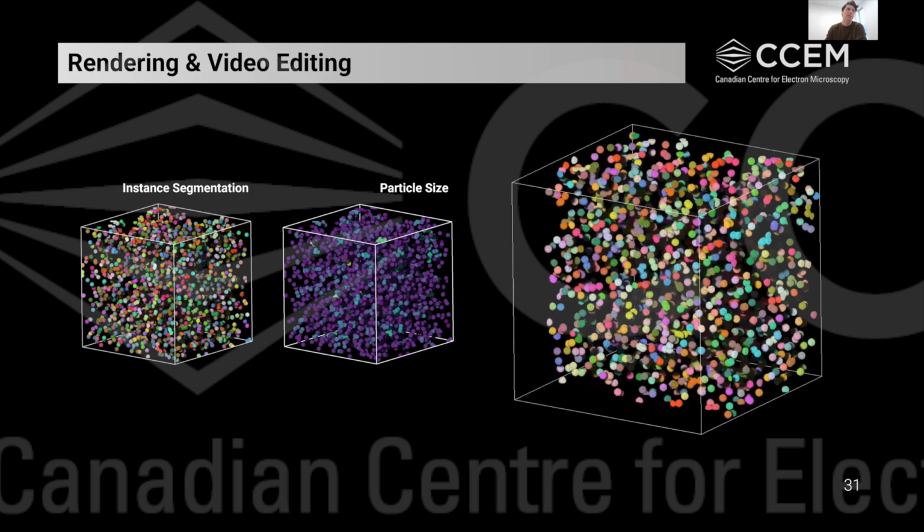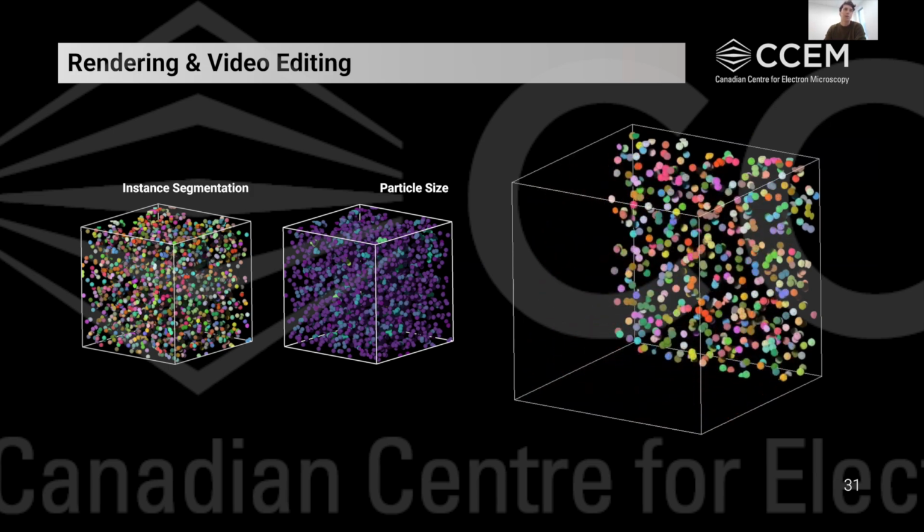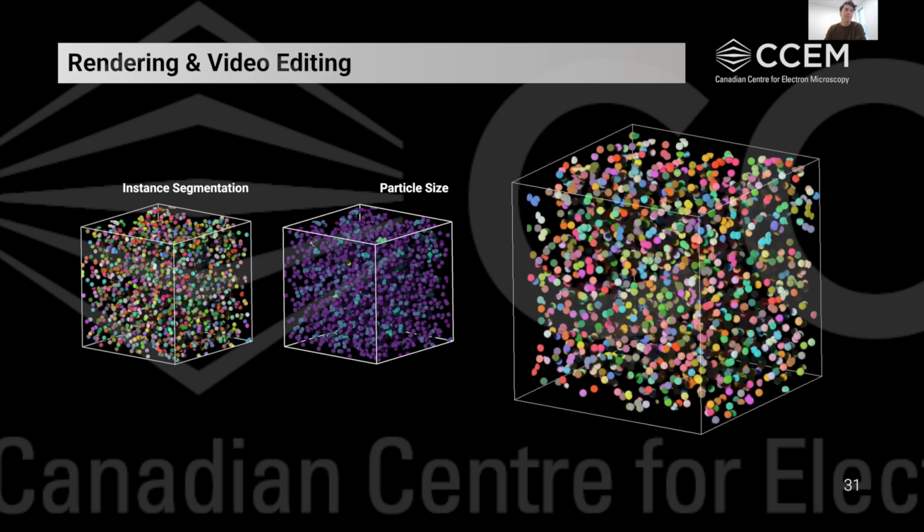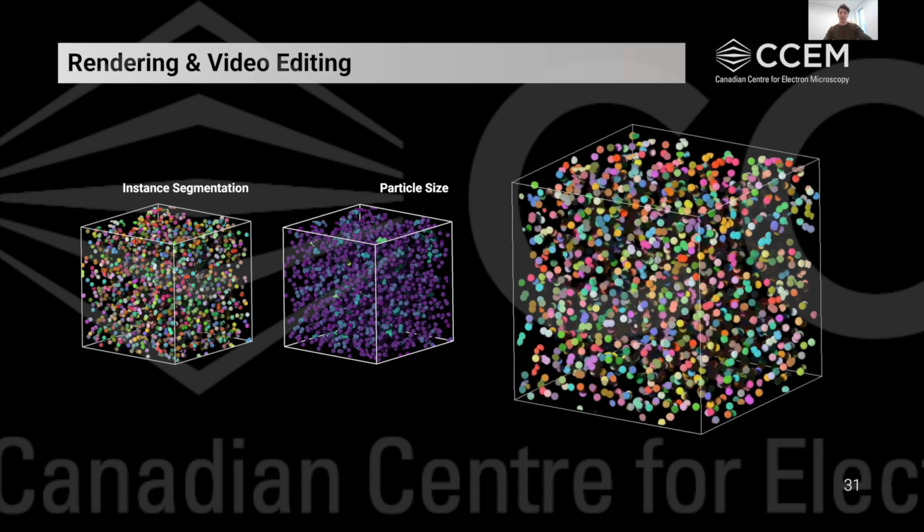We can slice through our sample digitally to see what's happening on the inside. And we get all sorts of important information as to what's happening on the inside of our 3D volume.